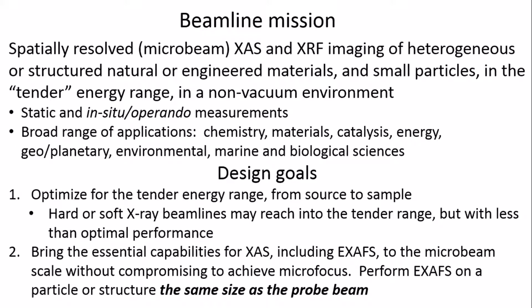So the Beamline mission is for spatially resolved microbeam scale spectroscopy and imaging of heterogeneous or structured materials, either natural or engineered materials, and small particles in a tender energy range, also in a non-vacuum environment. So it's friendly to samples that cannot be put in a vacuum. This includes static and in-situ operando measurements and covers a broad range of applications across a wide range of science.